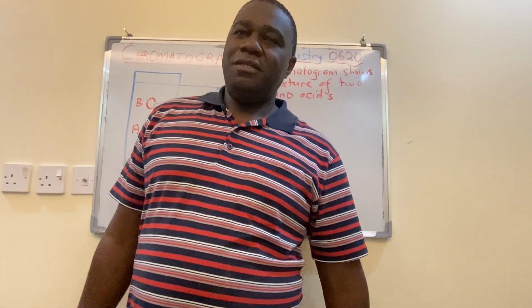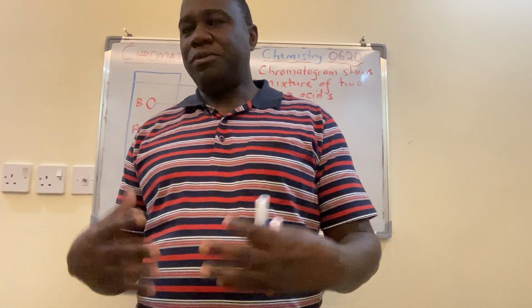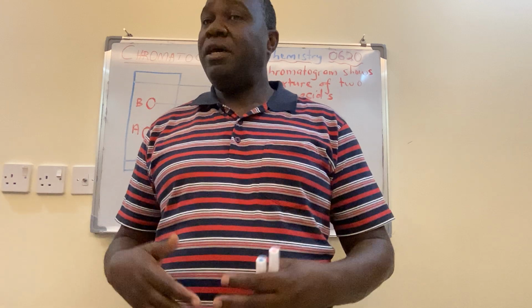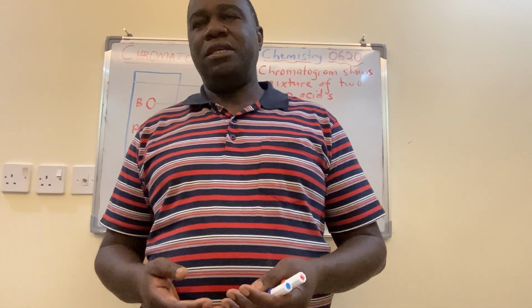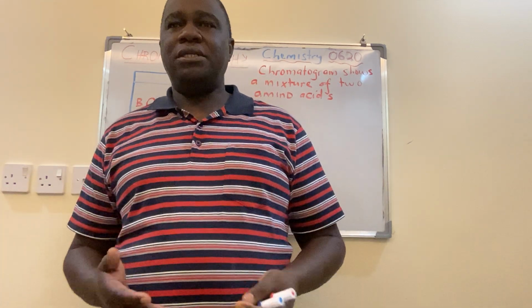Good day, students. In this video, we're going to look at chromatography. I suppose your teacher, or in your class, you've discussed several methods which are called separation techniques. It could be filtration, evaporation, distillation, fractional distillation. But chromatography is one of the physical methods that we can use to separate substances.